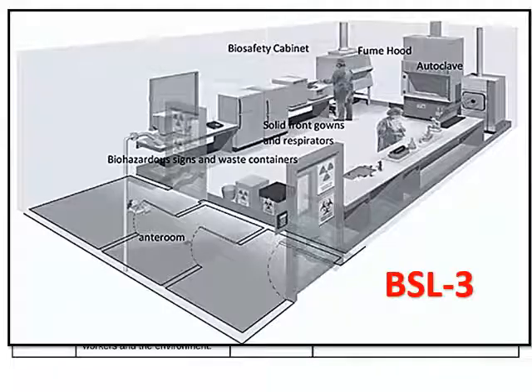Here's a biological safety level 3 lab like the one they have at the BC CDC. There's a nice woman who works in there. She's a microbiology technician. She spends her whole day in that lab because it's a lot of trouble to get in and out of the lab. So she takes her lunch in with her and she eats it in a special room where she doesn't have to come back out of the lab to eat lunch. She spends the whole 8-hour day in that lab. And you have a special airlock, right? Because remember, the air pressure inside the lab is lower than outside. So there's one room that has a door to get into the room and then a door to get out of that room and into the lab. It has 2 doors. Right?